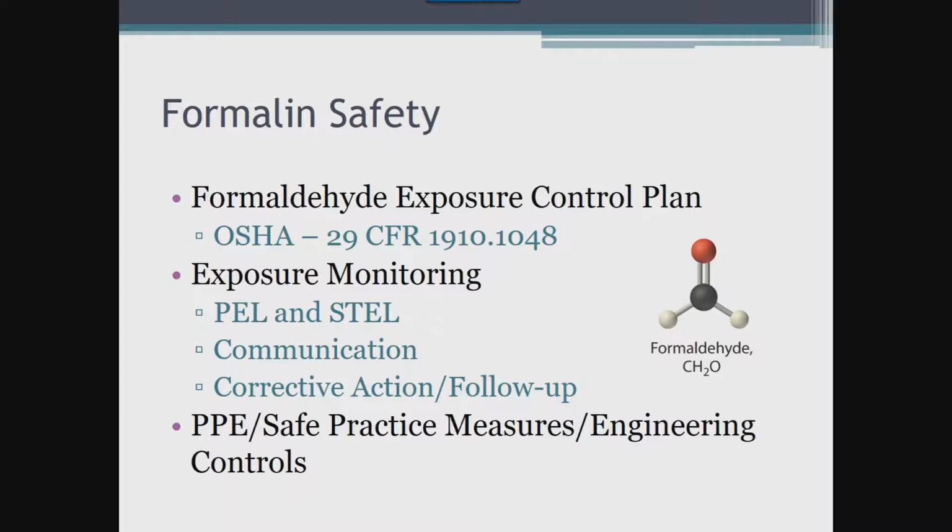Periodic monitoring is mandated only if permissible exposure limits within an 8-hour period exceed the action level of 0.50 ppm or short-term exposure limit of 2.0 ppm. When these levels are exceeded, immediate corrective action must be taken to decrease exposure. Frequency of monitoring should be increased until there is assurance that the level of exposure is acceptable. Repeat monitoring should also be performed if employees note signs or symptoms of respiratory or dermal conditions associated with formaldehyde exposure. All data must be maintained within the quality control program within the department.